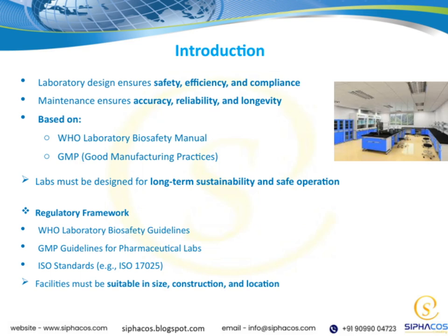Finally, the physical aspects of the lab matter a lot. Facilities need to be appropriately sized, constructed with suitable materials, and located in environments that support their purpose. All of these elements work together to create a lab that is not only compliant, but also safe, efficient, and capable of supporting ongoing scientific work.